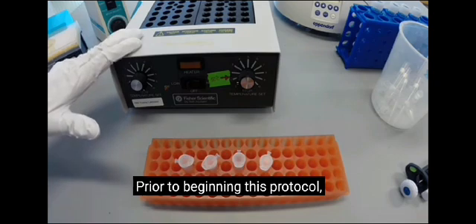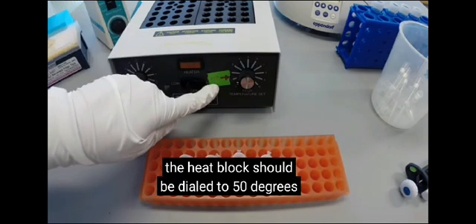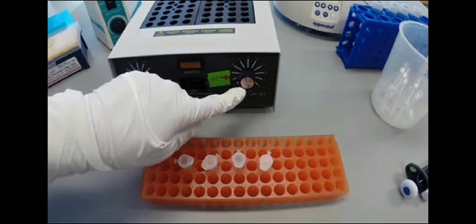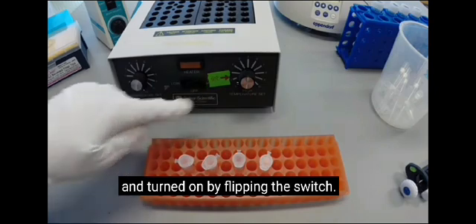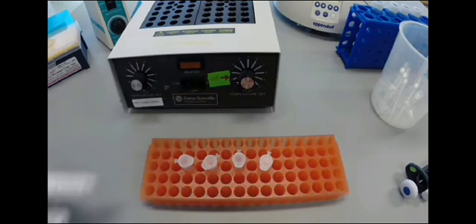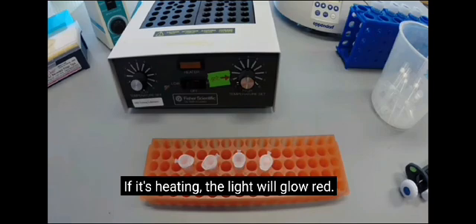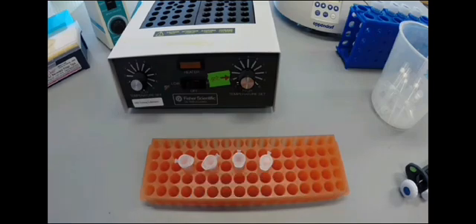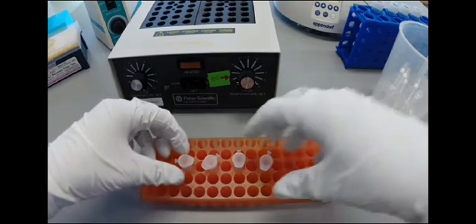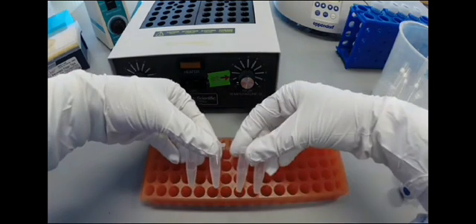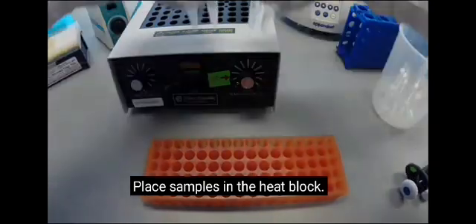Prior to beginning this protocol, the heat block should be dialed to 50 degrees and turned on by flipping the switch. If it's heating, the light will glow red. Place samples in the heat block.